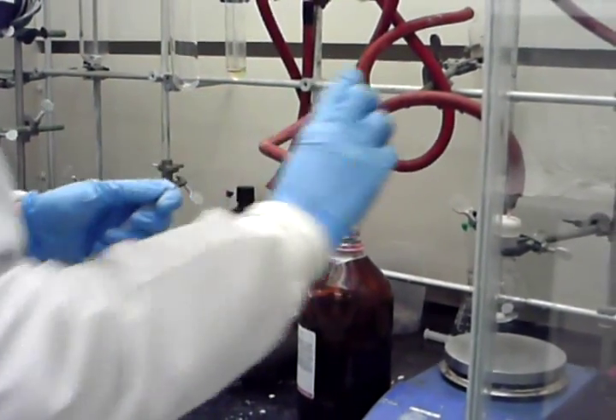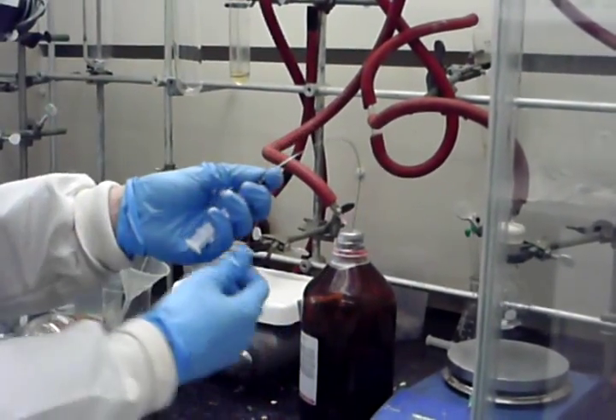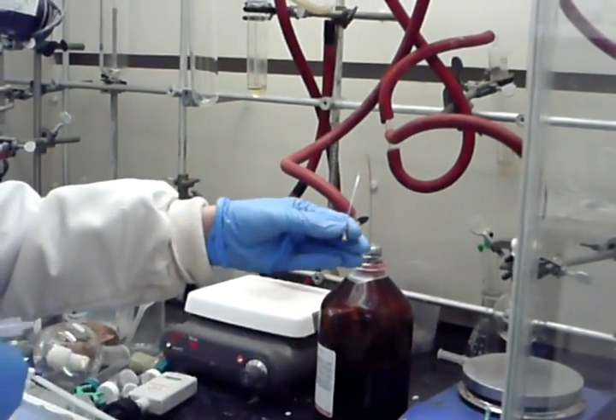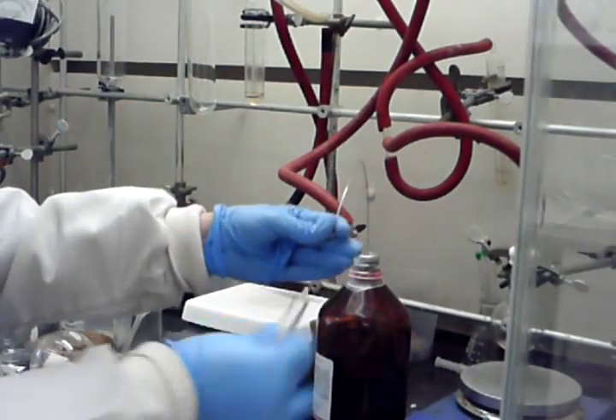The next thing to do is degas your syringe. Insert your syringe needle in, but don't go below the level of the liquid, and slowly pull it out. What you're doing is removing the air that was in the needle as well as in the syringe. You do that three times.